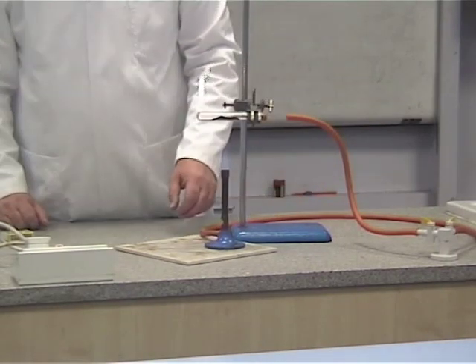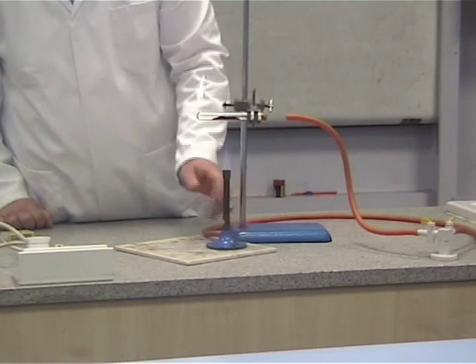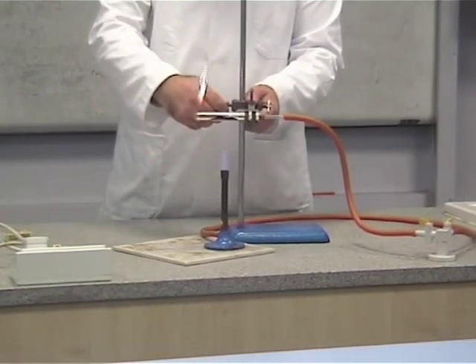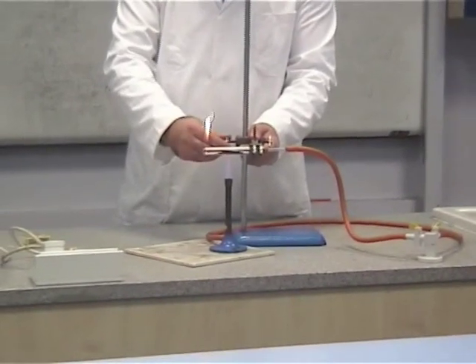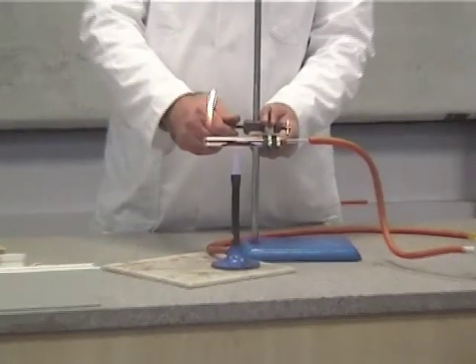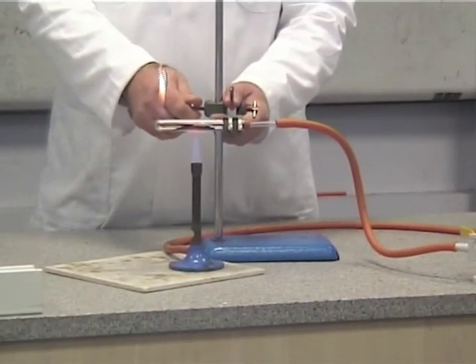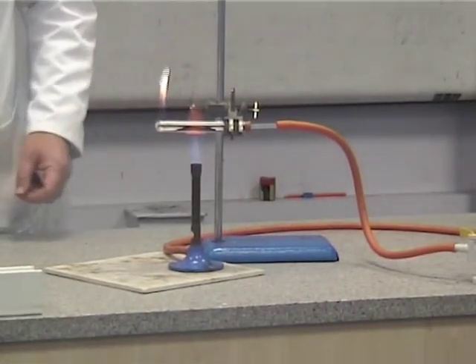So there we leave the experiment heating. Let that get as hot as we can. And if you're not too happy about the height, you can quite simply just adjust it down onto the hottest part of the Bunsen burner flame. It usually takes about 5 minutes or so for that to react.